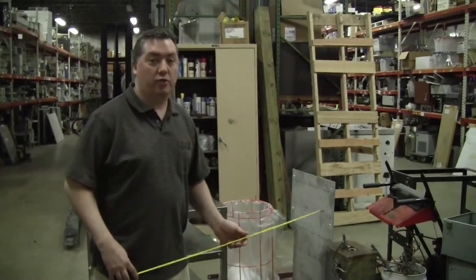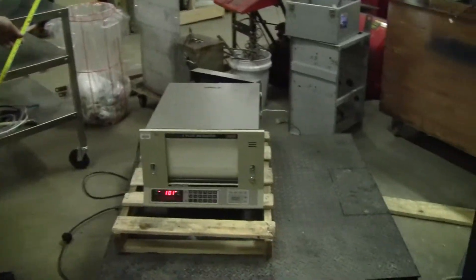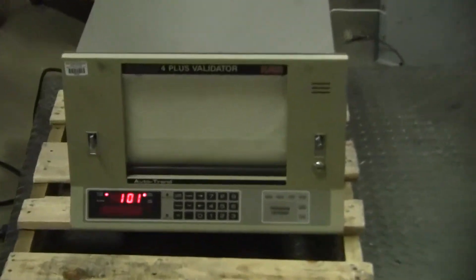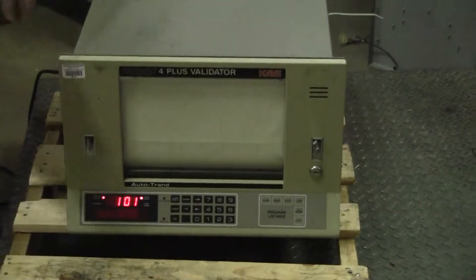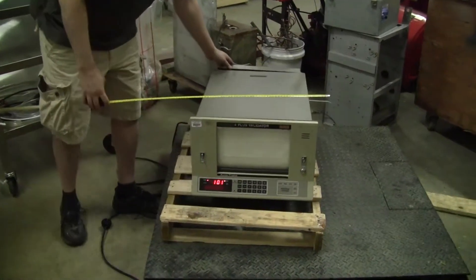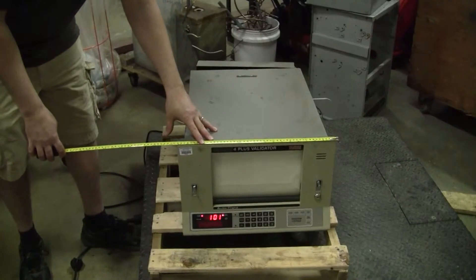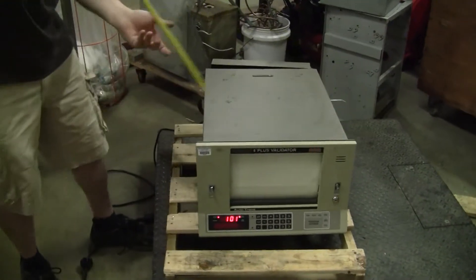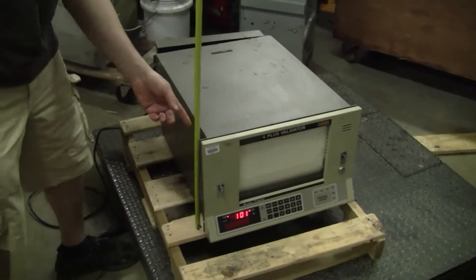Hi, this is Michael Natow from Hitech Trader. Today we're looking at the K Digitrip 4 Plus Validated. The unit itself is 26 inches by 19 inches by 14 inches high.